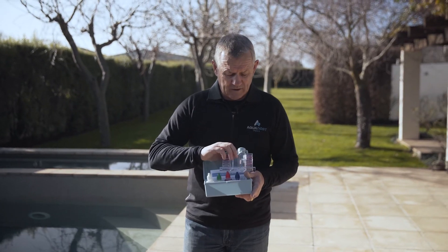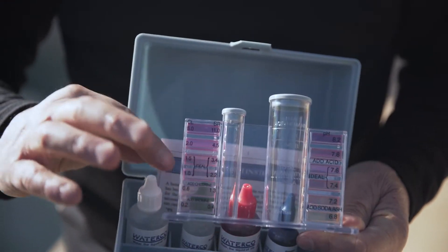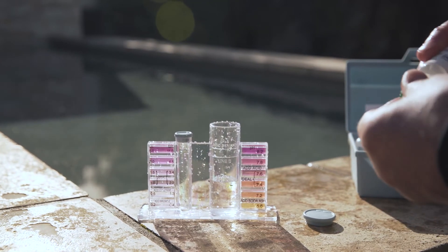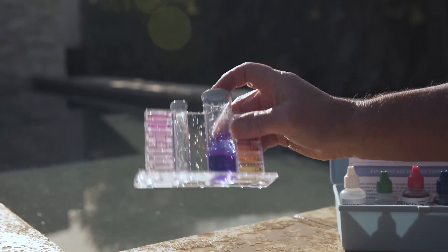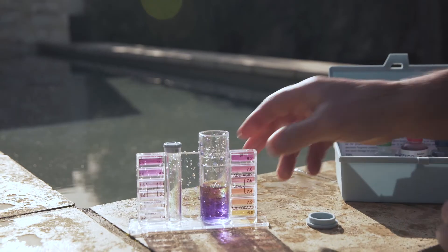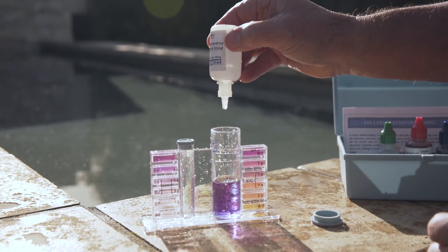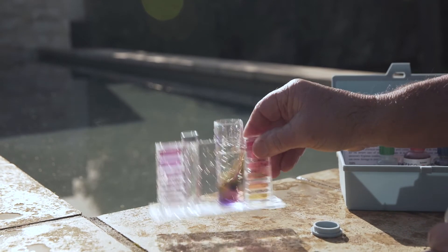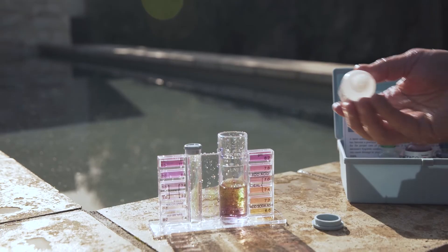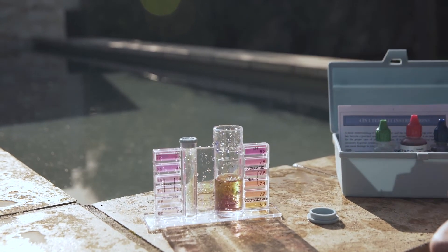The third test is the alkalinity test. We fill a vial to the alkalinity line, which is clearly marked. We add one drop of number four and two drops of number five. Shake it up and down to mix it — the water will be blue or purple. We then add one drop at a time of number three until it goes clear or yellow. Ideally the alkalinity should be between 8 and 12 drops, so 80 to 120. Each drop is worth 10 points.